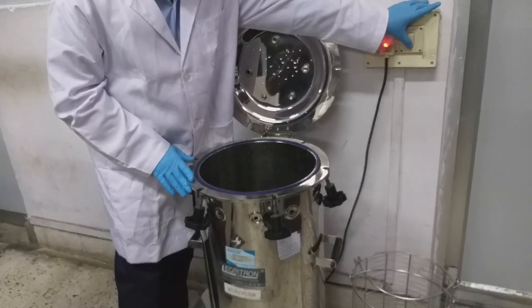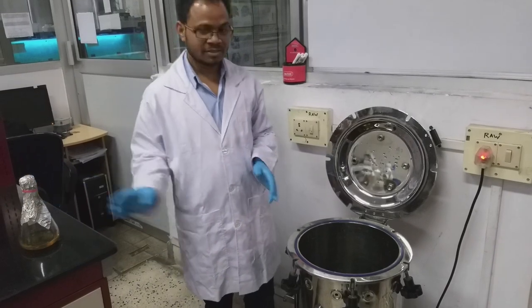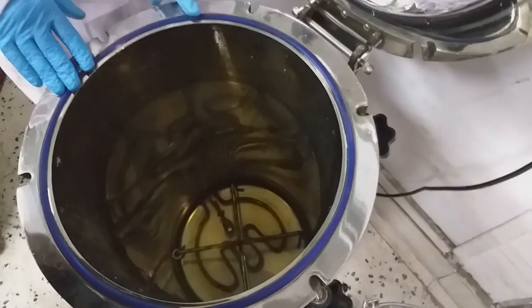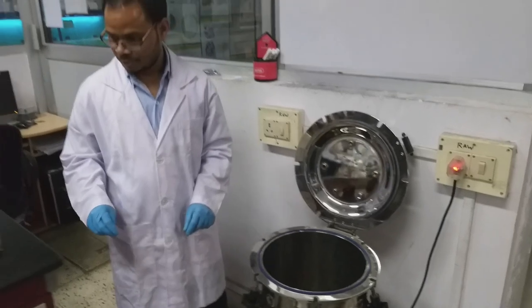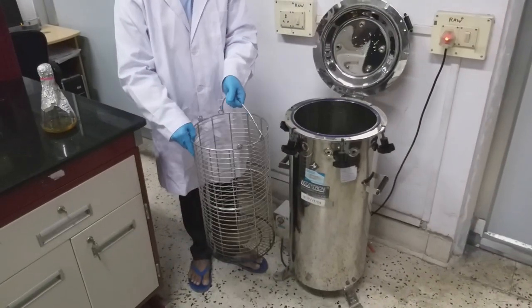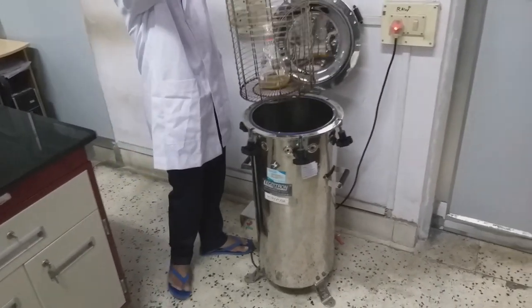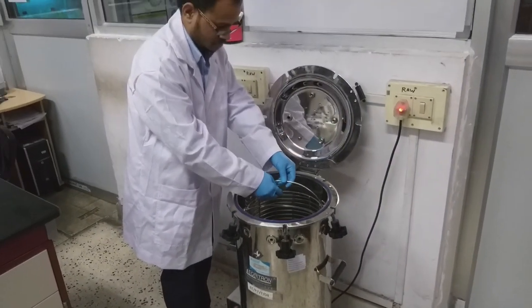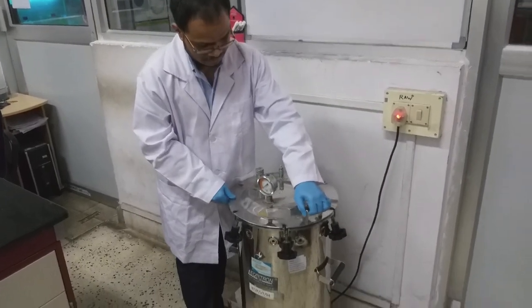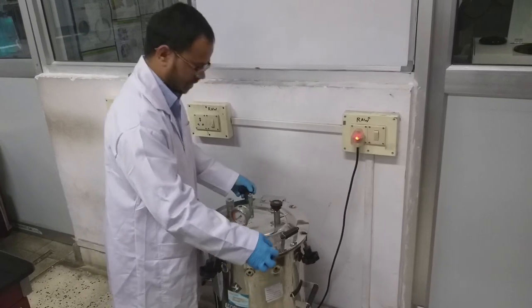We have to turn on the autoclave. So you can see here the bulb is glowing. Before keeping the media components in the autoclave, make sure that the heater inside the autoclave is submerged in water. Now I am going to keep the media components in the basket which we use for the autoclaving. Then keep this one inside the autoclave. While closing the autoclave, make sure that you are closing in the opposite direction.